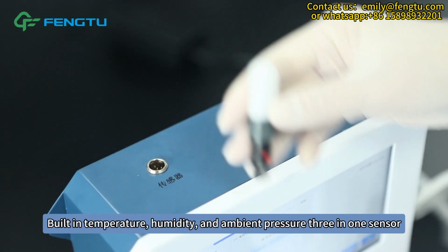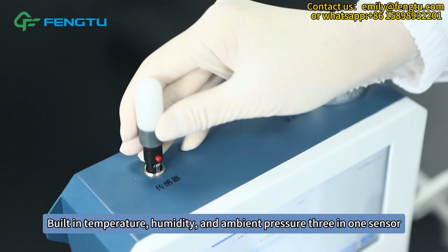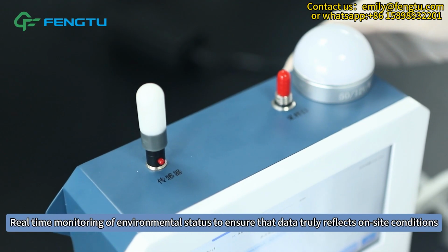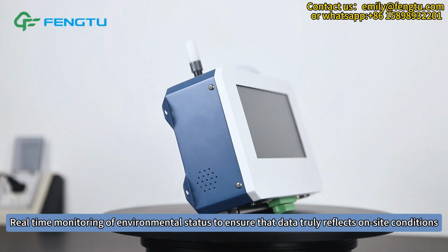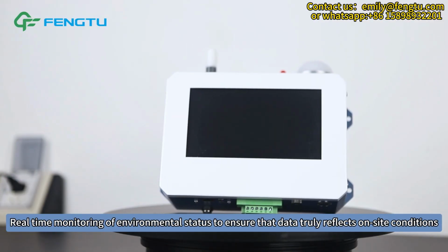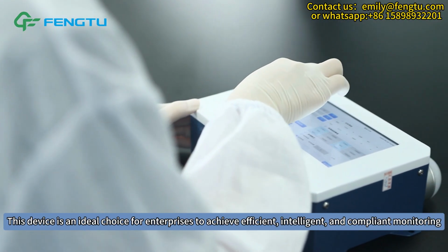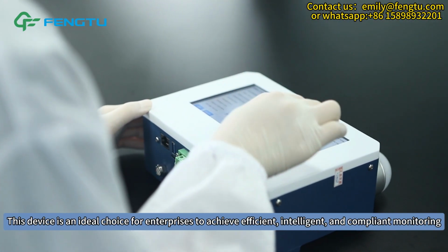Built-in temperature, humidity, and ambient pressure 3-in-1 sensor. Real-time monitoring of environmental status to ensure that data truly reflects on-site conditions. This device is an ideal choice for enterprises to achieve efficient, intelligent, and compliant monitoring.